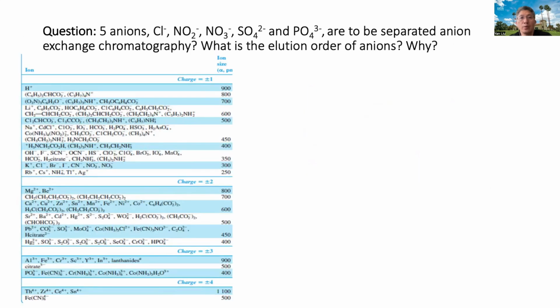One example to review is the separation order of commonly seen inorganic ions. In general, a great K value is seen in the ions with a higher charge, smaller hydrated size, and greater polarizability. Hydrated size shows the dimension of ions in water, or complexed with water molecules.